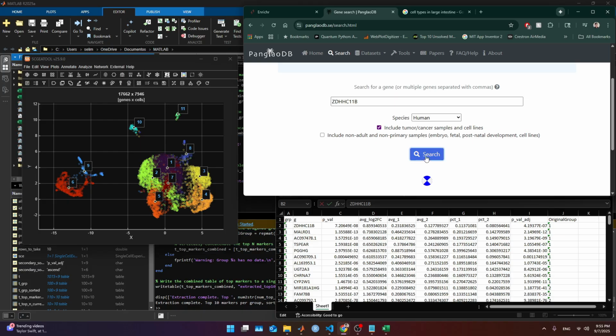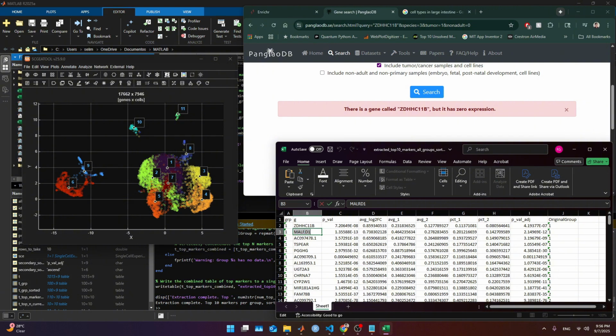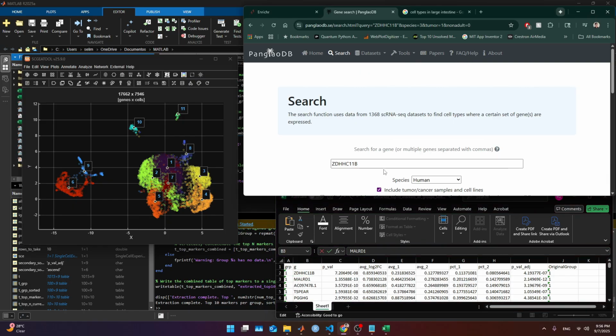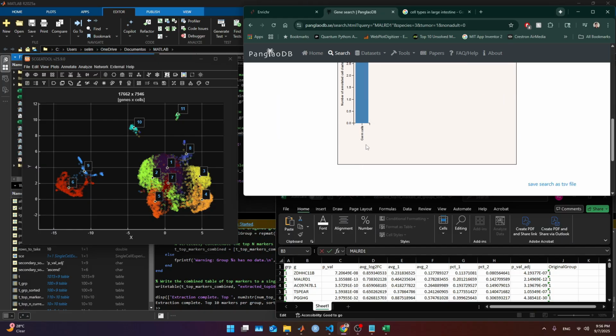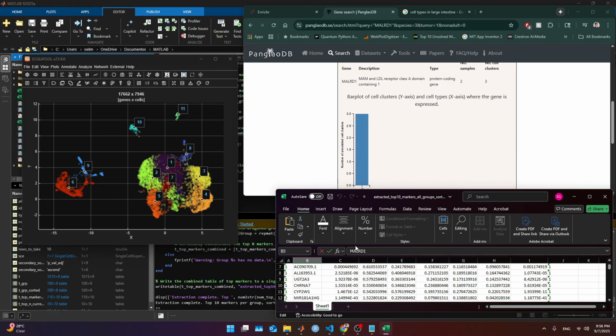So we are gonna grab this. And let's see, nothing came out. Not surprised, I haven't seen that guy before. But we can go back and forth looking for information of each gene. Oh, this one points out something. Germ cells. That doesn't make sense in my sample.